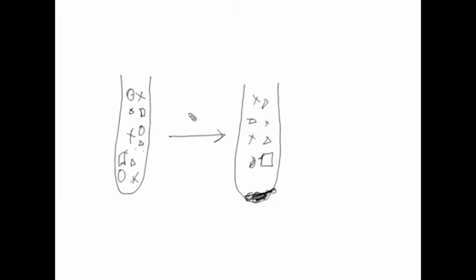So, why do you get partial purity? When a centrifugal field is applied, different molecules will sediment at different rates, but these molecules are homogeneously distributed all over the tube. A molecule which is here will experience a particular force, and the molecules already present at the bottom will also experience certain force.